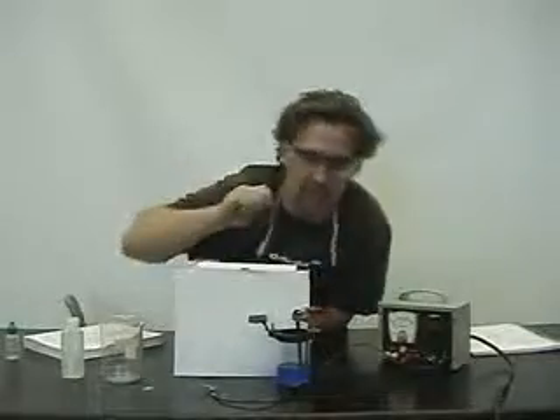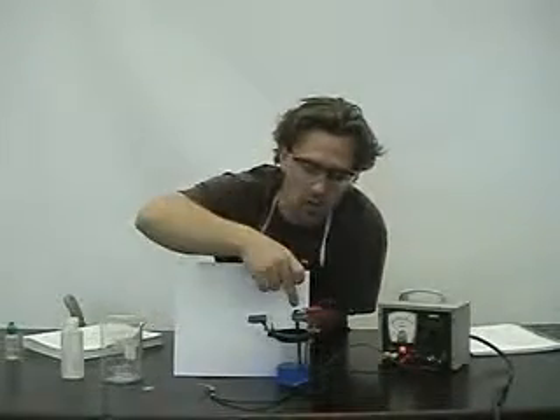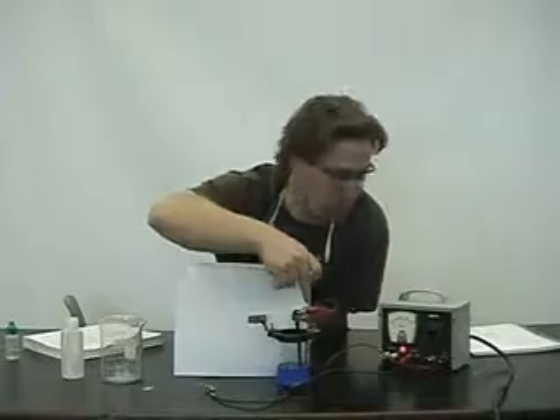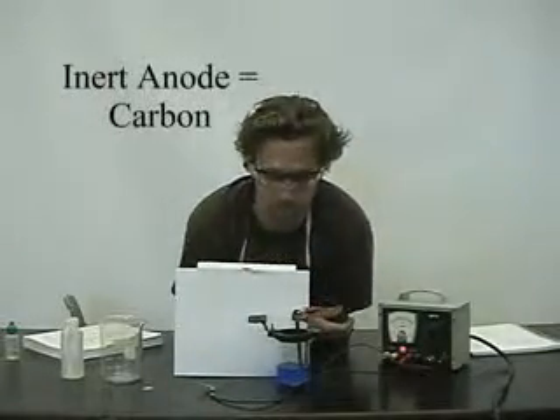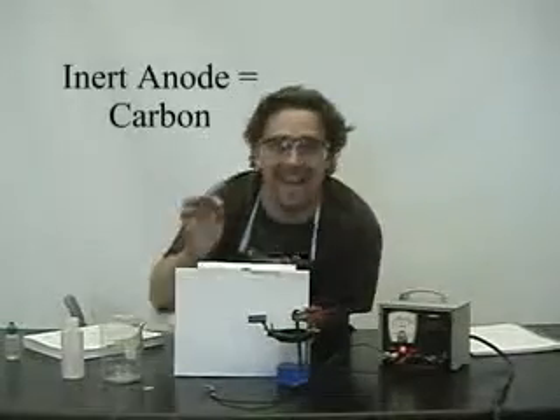I've set up a little apparatus here. The basic components of the apparatus for electroplating are as follows: you want an electrode hooked up to the positive terminal — that's going to be our anode. I've got a solution here containing the ion that I'm going to plate. The solution we have today is copper sulfate, and we've prepared a one molar solution.